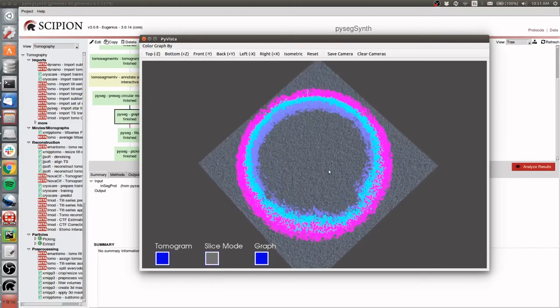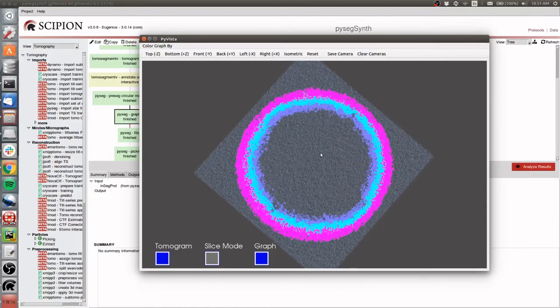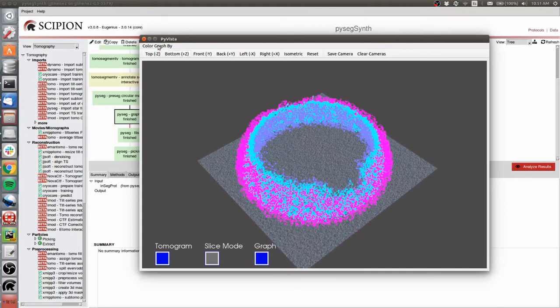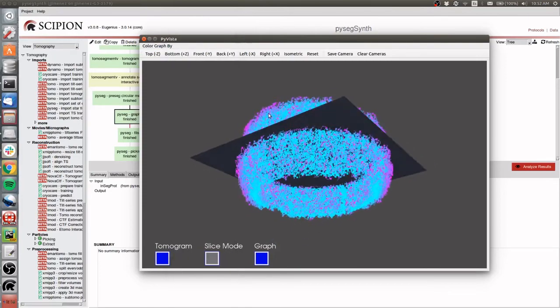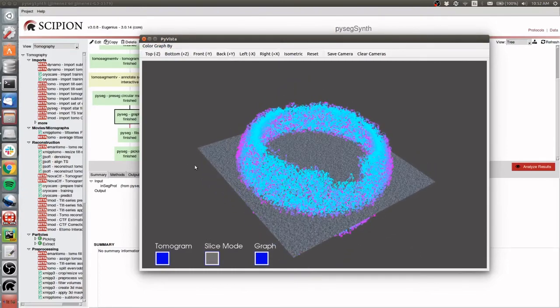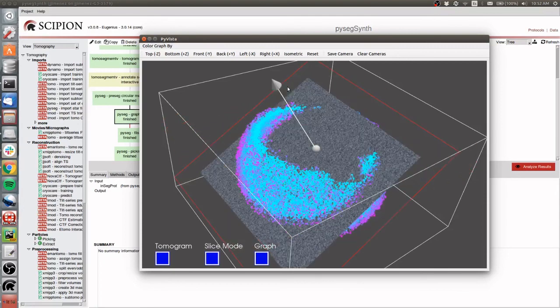show you. The graphs present a different color depending on the area they have been calculated, and I can also display a lot of metrics such as the membrane, Euclidean distance, and so on. The same tools shown in the viewer for the annotated membranes can be found here, which is the slice selection, the slice cutting, and so on.